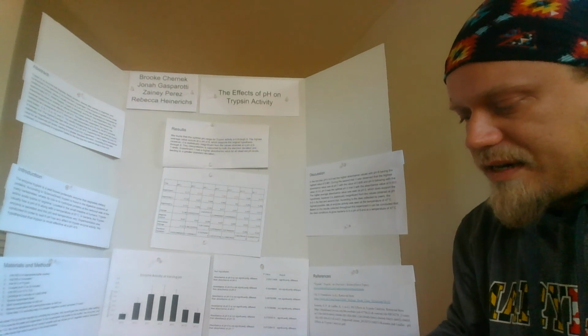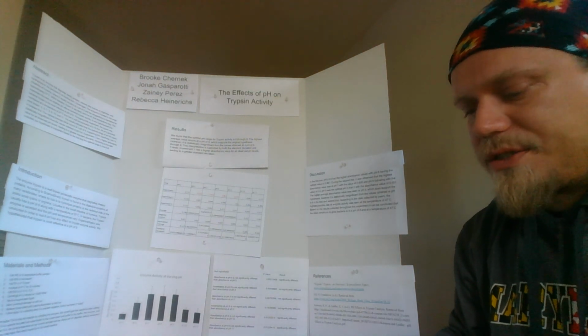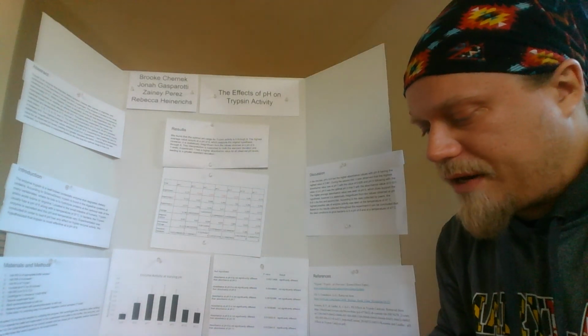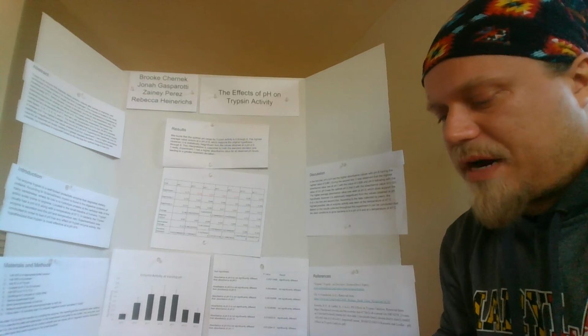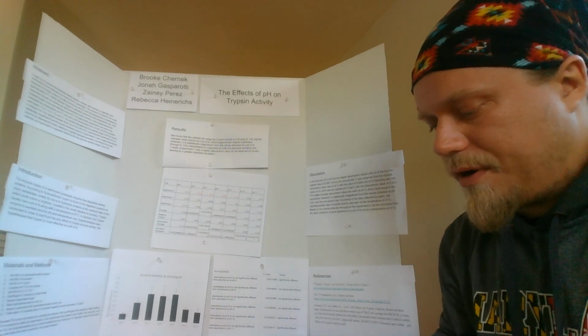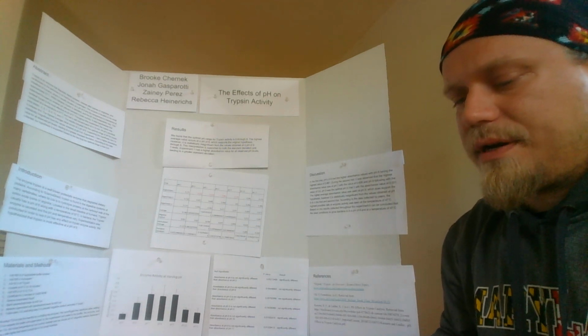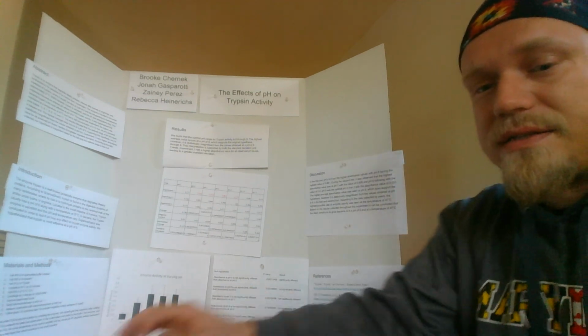The first trial data stands out. It was performed separately from the other 2 trials, so an inaccuracy in pipetting or a difference in incubation could have accounted for the difference. The hypothesis is not rejected, but further tests are required to determine its optimum pH range, as well as possibly eliminating trial 1 as an outlier.